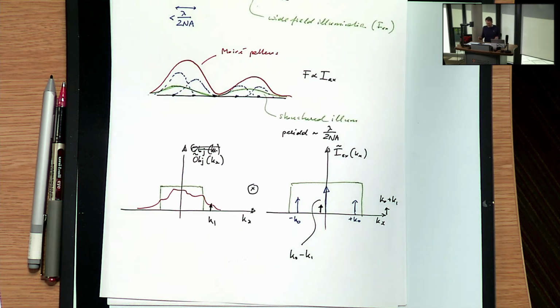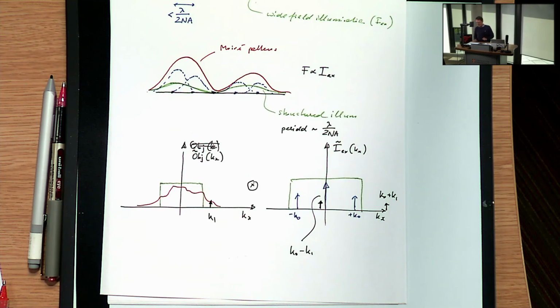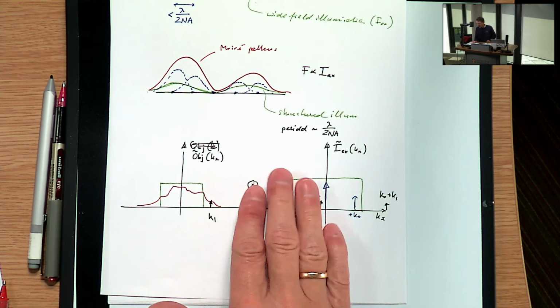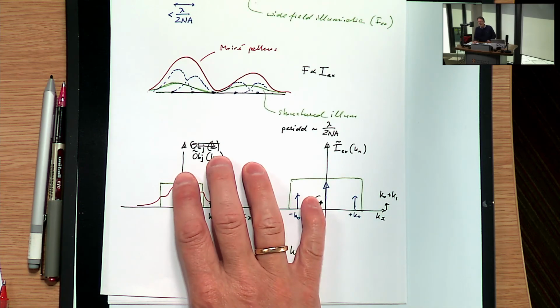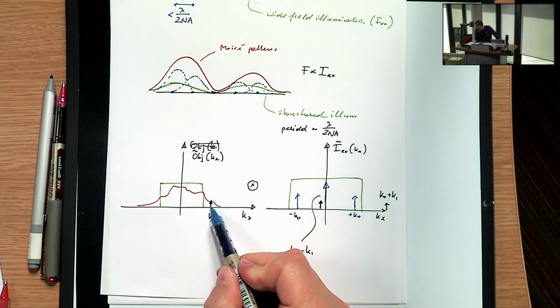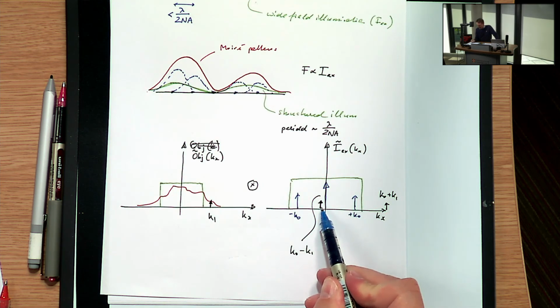Can you see why that's happening? You work that out from the convolution theorem. And that's precisely what we showed on the first picture when we shifted the spectra around, right? So this one here comes from the copy of this spectrum that is placed over here. That's how that frequency tail comes in. Then, what's the maximum K1 I can still pass through the instrument?